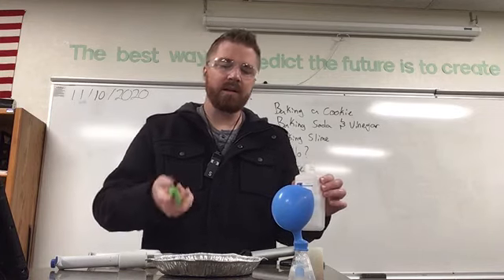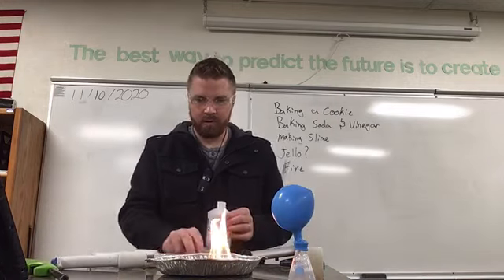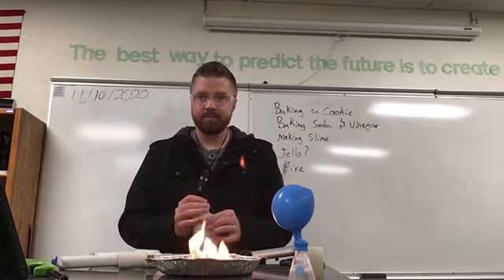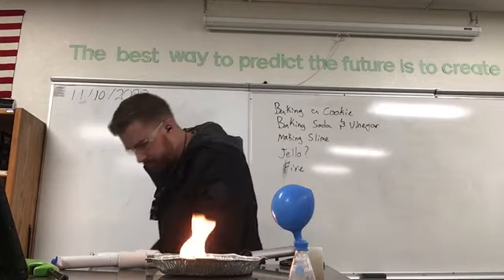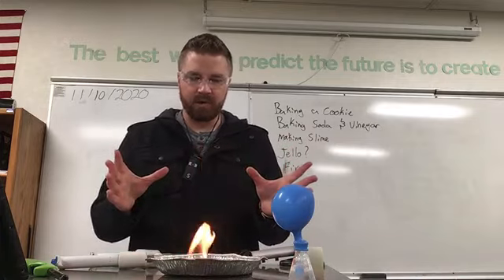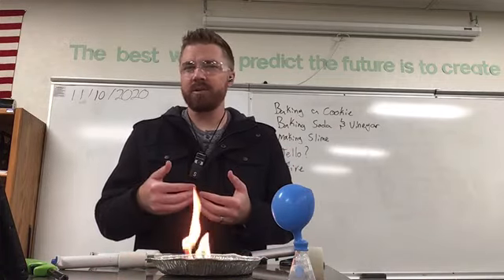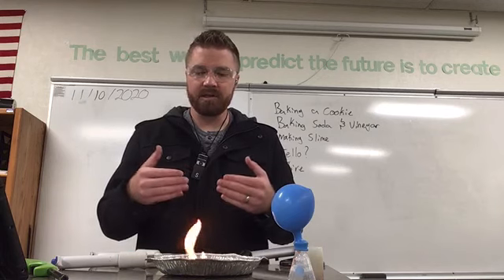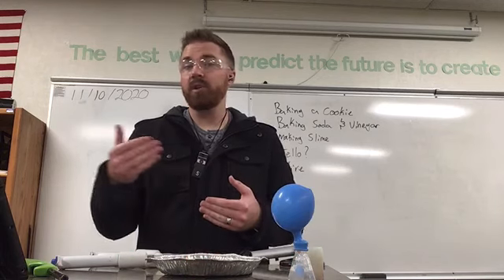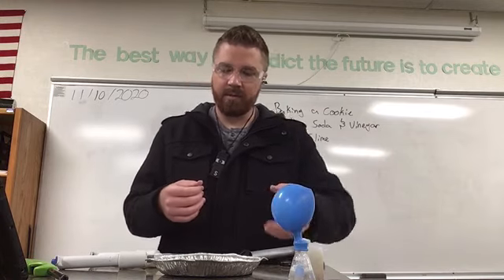How does it feel? Okay. Things like that. And this will actually just burn itself out, right? But it's another one where we're still seeing a flame. Flames are important with chemical reactions because they show that energy is being released. That energy, both heat and light, is being released through that chemical reaction.